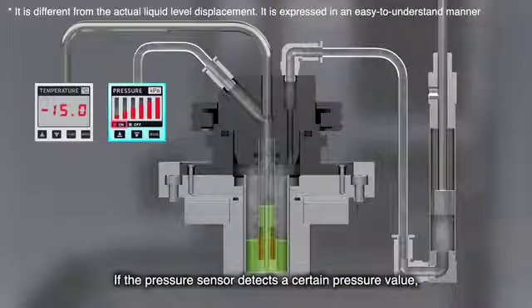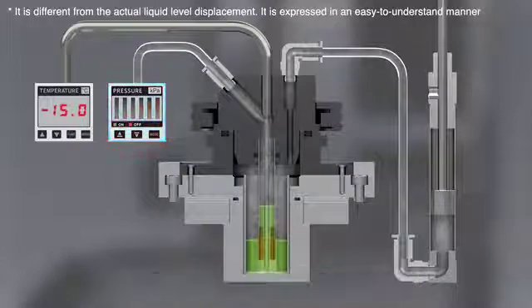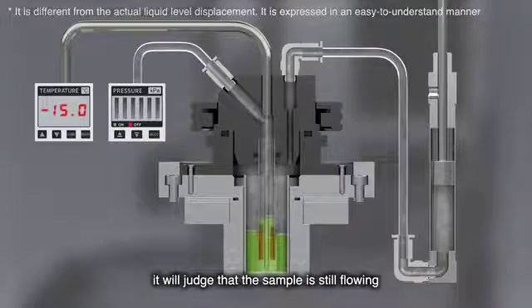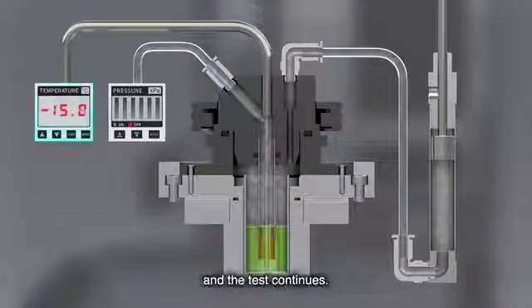If the pressure sensor detects a certain pressure value, it will judge that the sample is still flowing and the test continues.